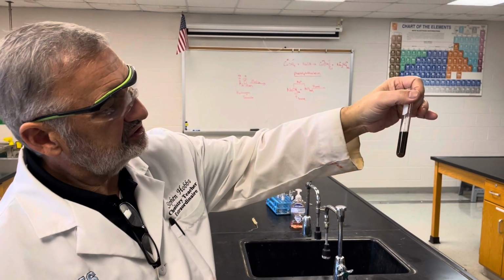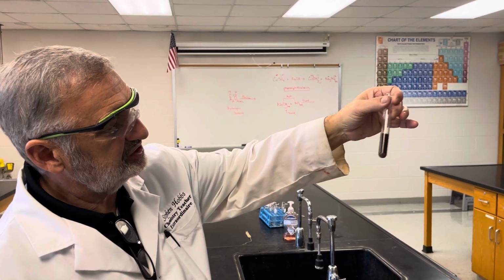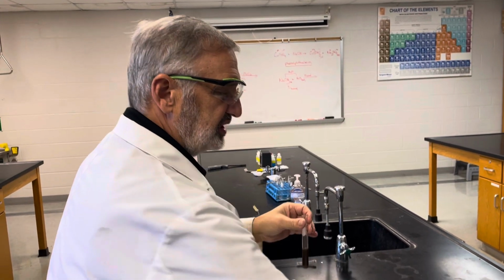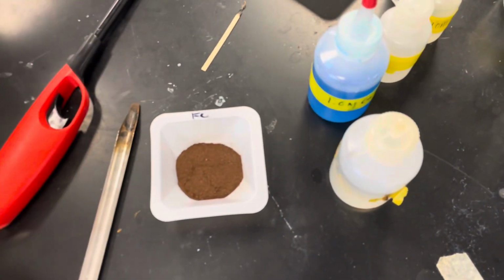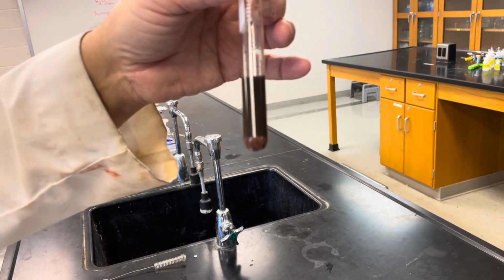So you need to record all those observations down and see what's happening, and write your balanced equation for, again, your copper sulfate aqueous solution combined with iron filings, that's just Fe, and you end up getting this. We'll come back and look at this one after we let this settle out just a little bit.